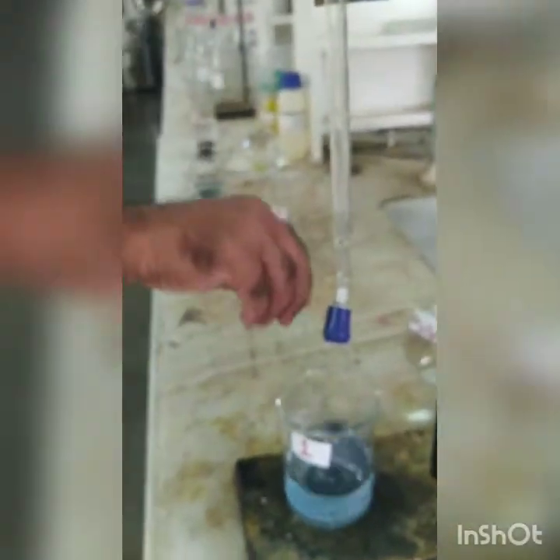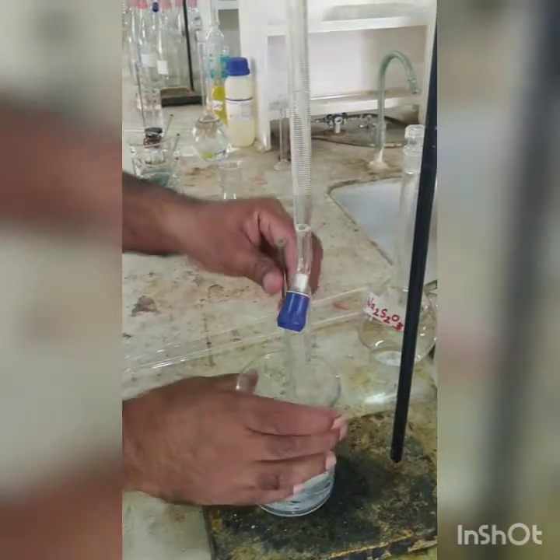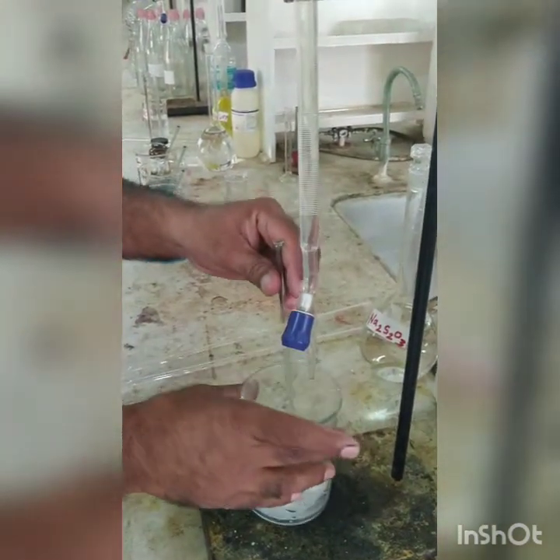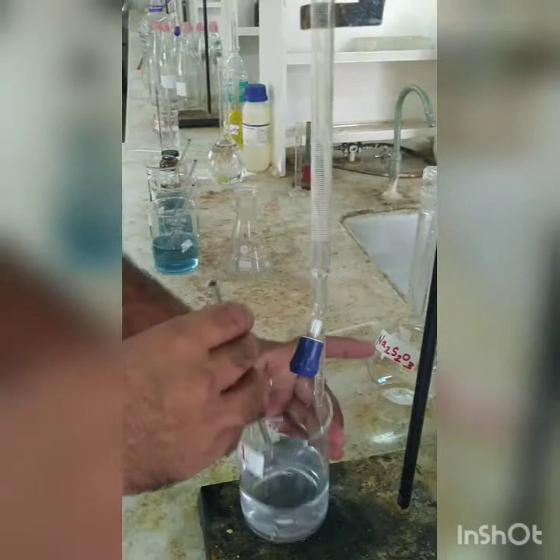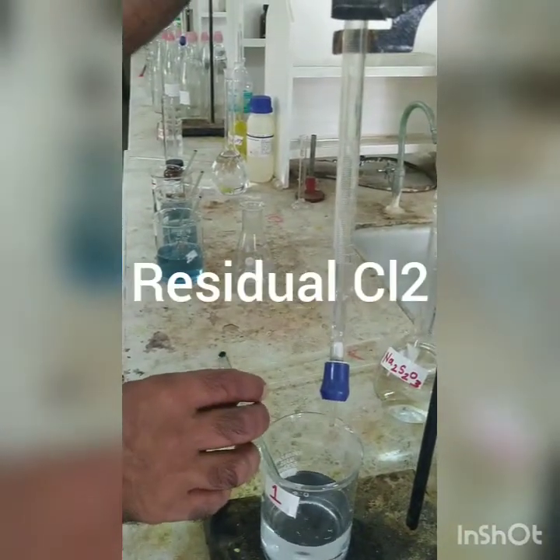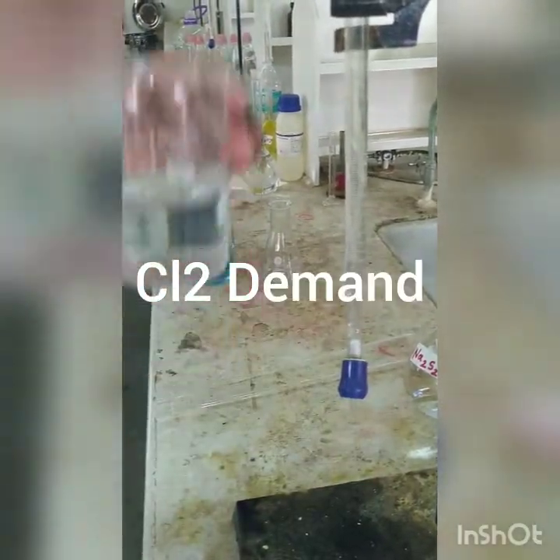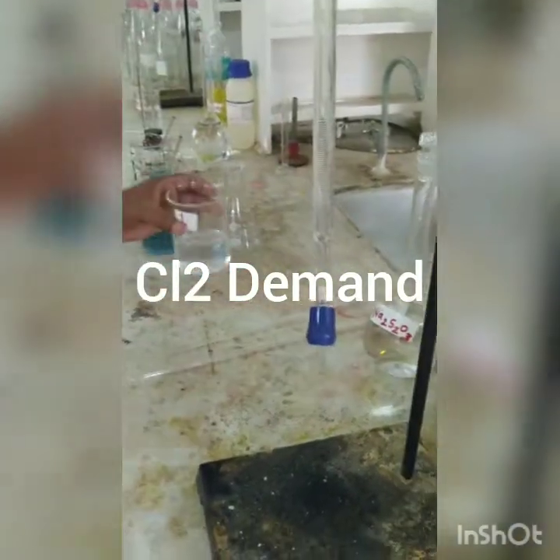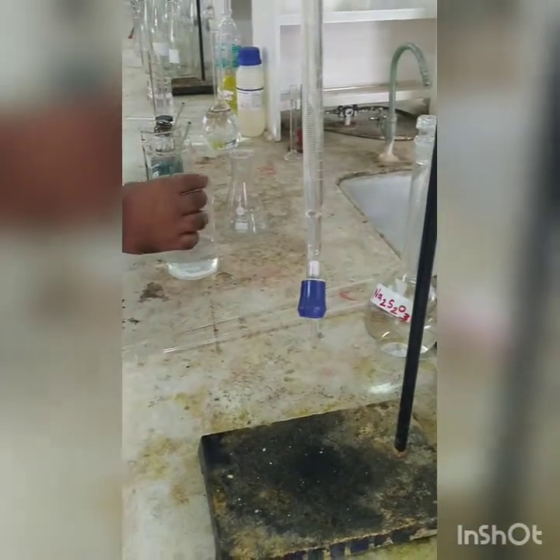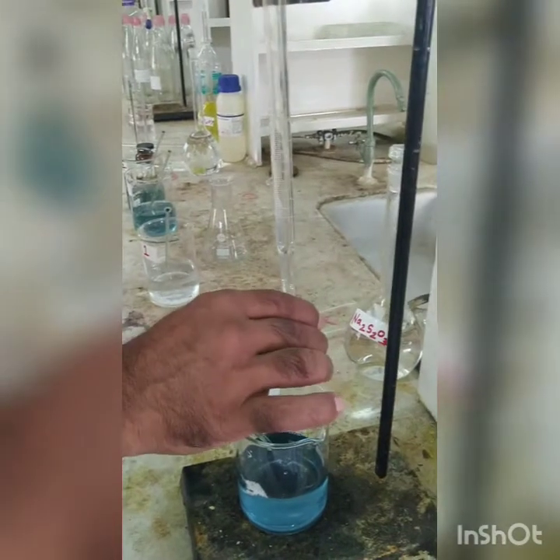First sample is being titrated. First beaker, having a chlorine dosage of 0.5 mg per liter, till first disappearance of blue color. 2.2. Yeah. Go to the second beaker. You are continuing from 2.2. Just keep it in mind.